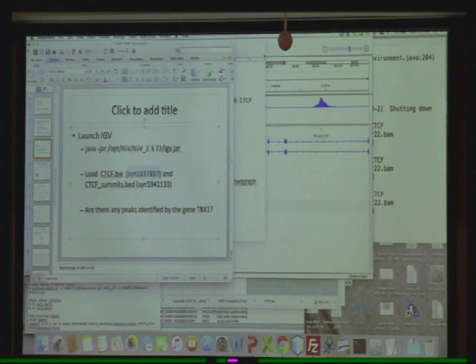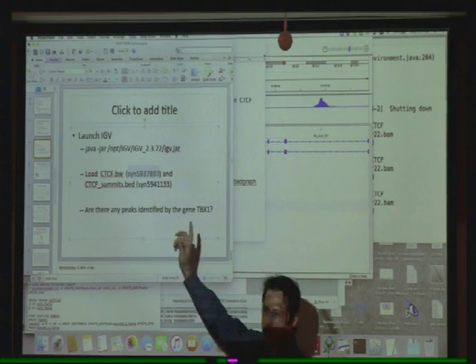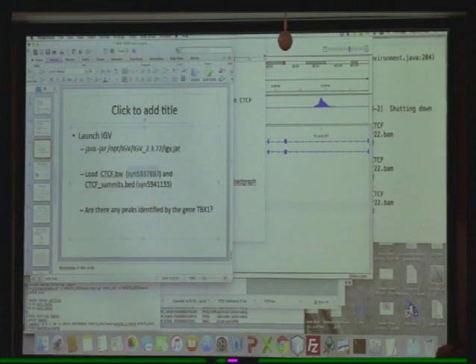If you want to go into your terminal and download it, you can do it that way. So if you're not in the X2Go client, just go synapse get ctcf.bw from your terminal, and it'll download the file for you. I've uploaded it to Synapse, if you didn't produce it yourself. Also, if you didn't get the summits.bed, you can download that here. I've uploaded that.